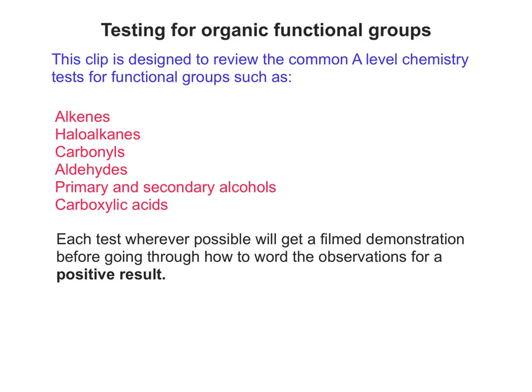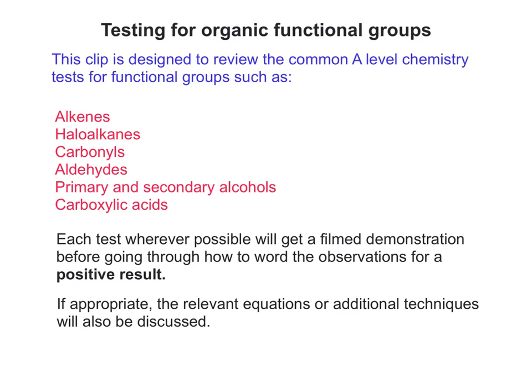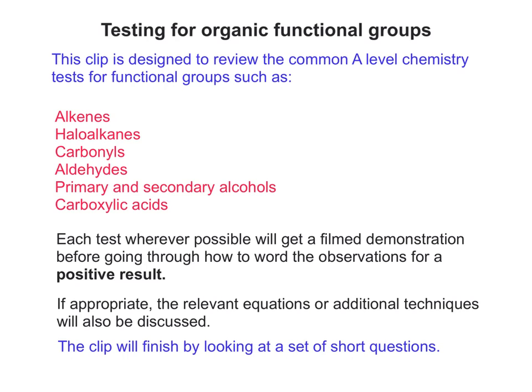And wherever I can, I'll include a filmed demonstration for each test so we can go through how to word the observations for a positive result. And in the appropriate cases, we'll look at the relevant equations or additional techniques needed to get a positive result. And finally, we'll finish off by looking at a set of short questions at the very end.